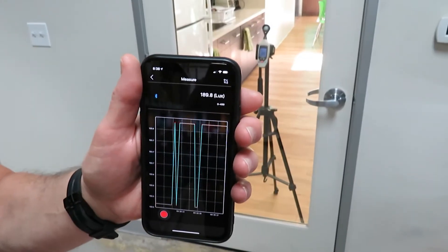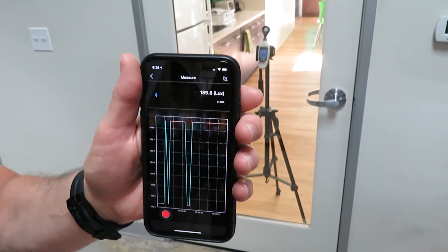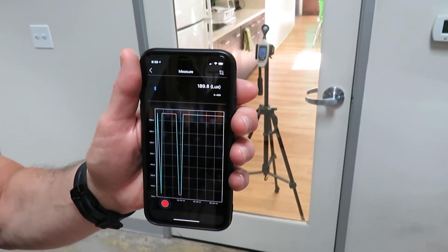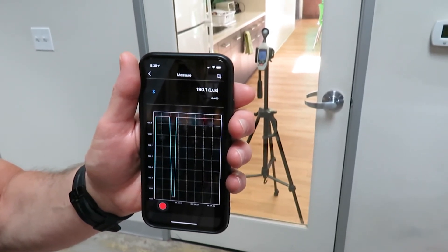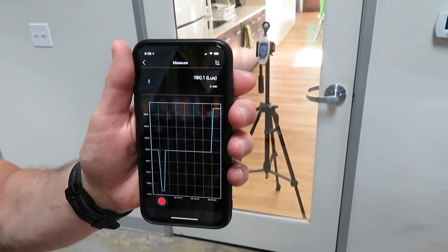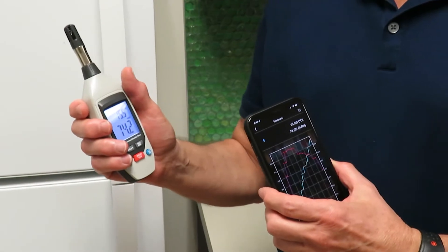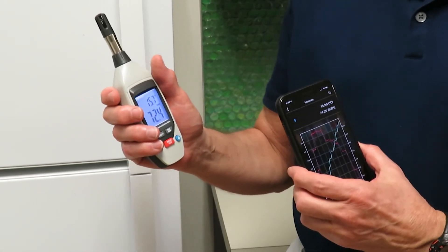In addition, these meters offer the convenience of Bluetooth for wireless communication with free apps. Results can be remotely viewed on your smartphone in real time, enabling the meter to be used as a remote wireless probe and as a data logger. Using the app, we can read results from inside a closed chamber.